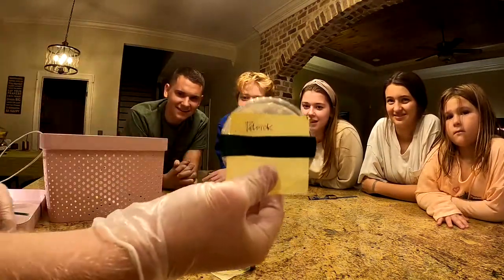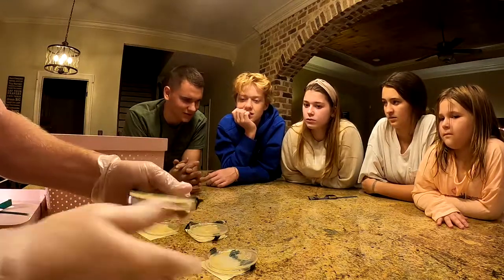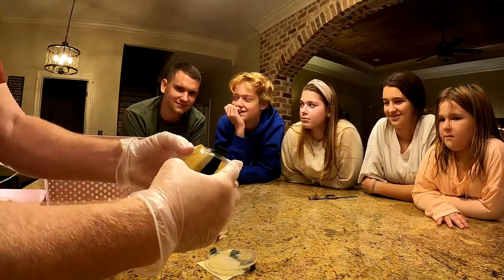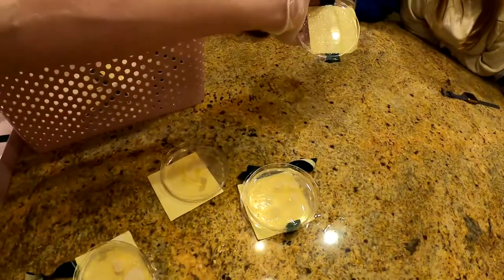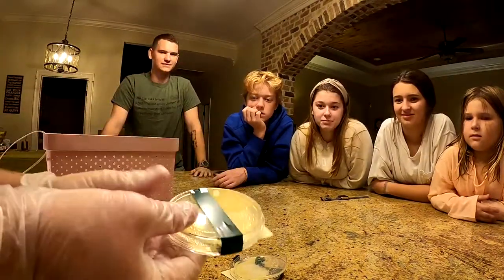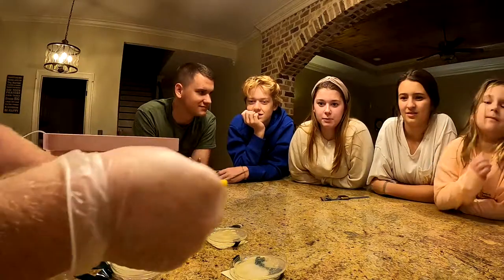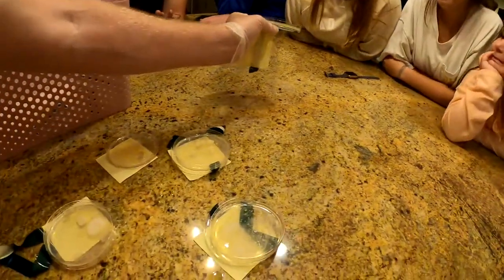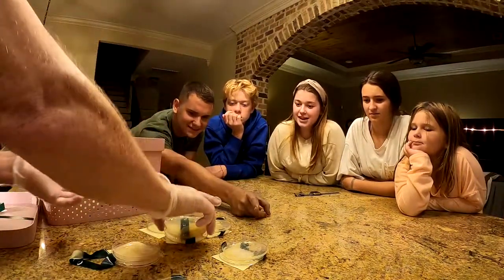Patrick swabbed the home button and volume button of his phone. The dish looks surprisingly clean at first, but there's bacteria growing all around the edges — actually one of the worst. Holly's sample is the sebum (oil) from her face; it shows growth but is less dense than Kalen's, consistent with washing her face twice a day.